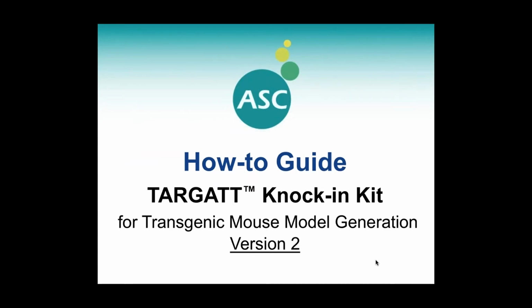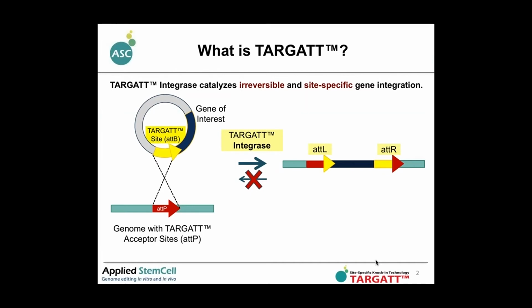In this how-to guide presentation, I will take you through step-by-step on how to use the TARGATT knock-in kits and the TARGATT technology to generate site-specific transgenic mouse models. Now first, what is TARGATT? TARGATT is an integrase-based site-specific gene knock-in technology.